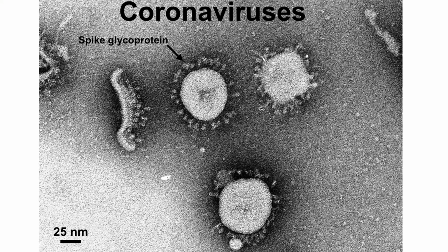And so we wanted to structurally characterize it. We wanted to understand, how do neutralizing antibodies interact with this protein? And what does that look like at the molecular level? So we've been using cryo-EM with a mixture of crystallography to really understand what are those interactions and how can we dismantle this spike glycoprotein.